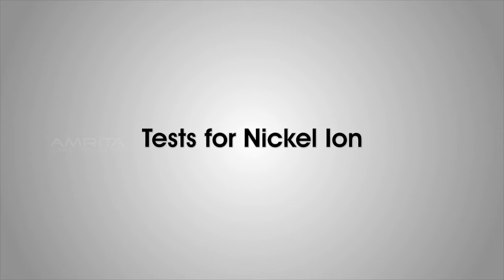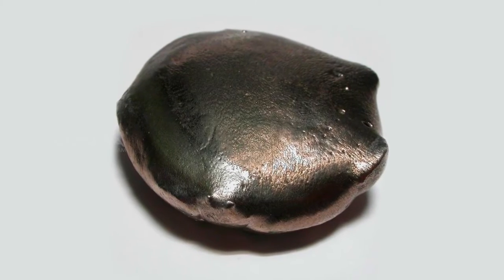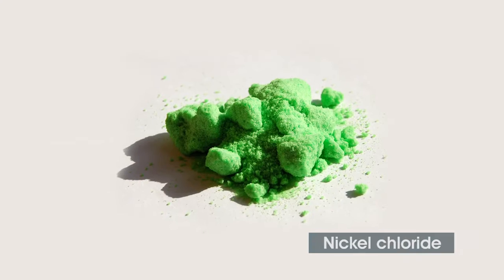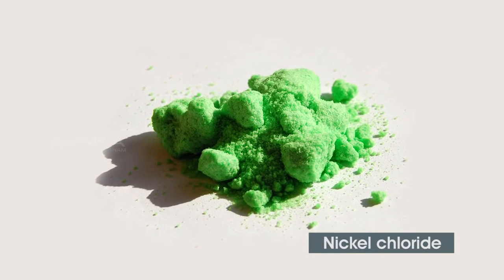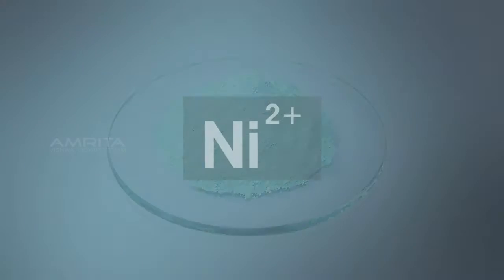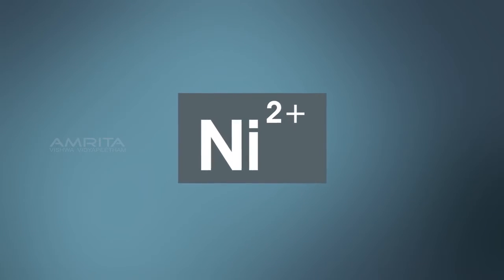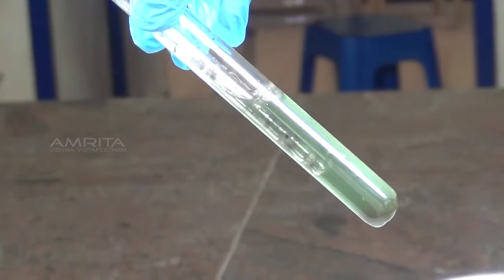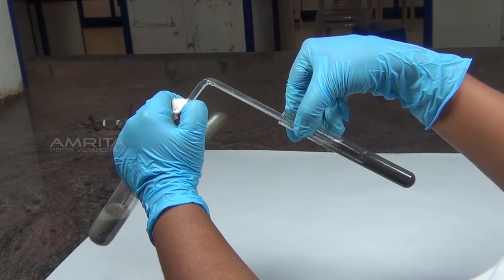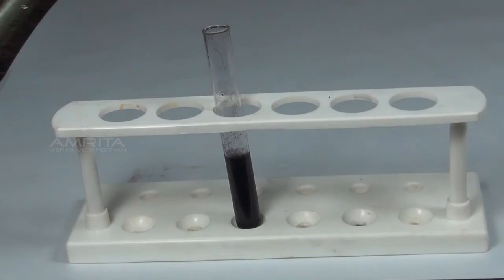Tests for nickel ion. Nickel is a chemical element with the symbol Ni. It is found in various salts like nickel chloride, nickel nitrate and nickel carbonate as nickel 2 positive ion. In group 4, nickel ions are precipitated as their sulfides by passing hydrogen sulfide gas through their solutions.